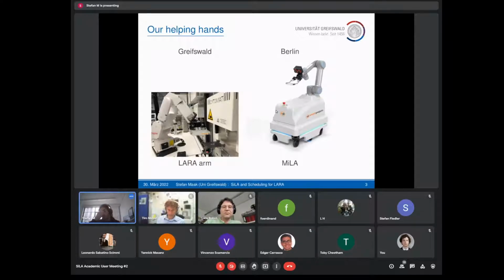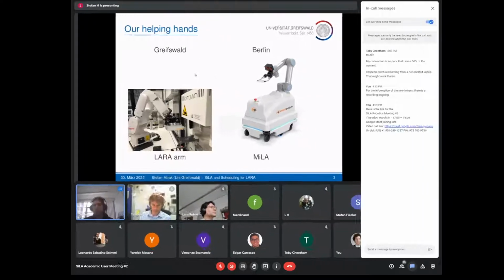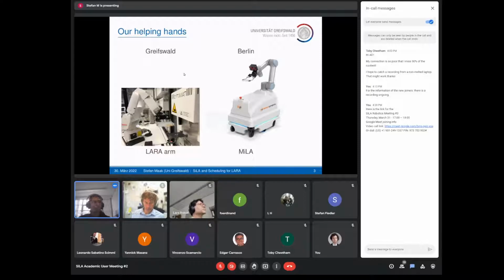From an automation perspective, it's just experiments which involve several devices and a lot of steps. This has to be automated because these experiments typically take 1 day, 2 days, and no one wants to do that by hand overnight and over the weekend, if not absolutely necessary, of course.